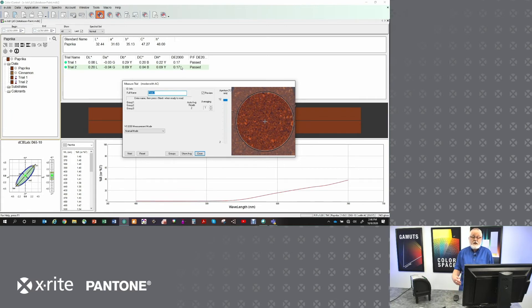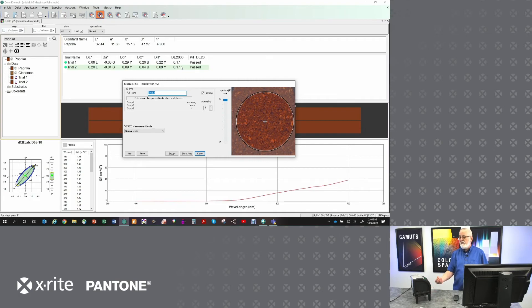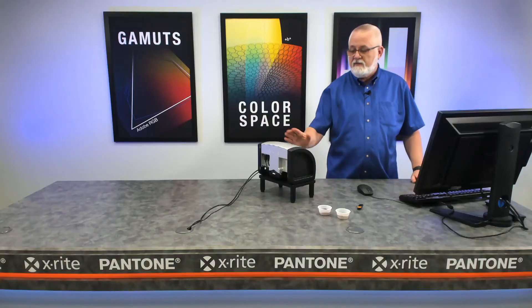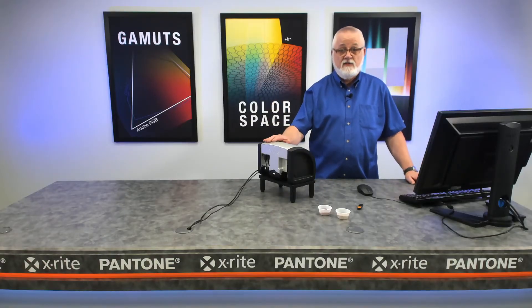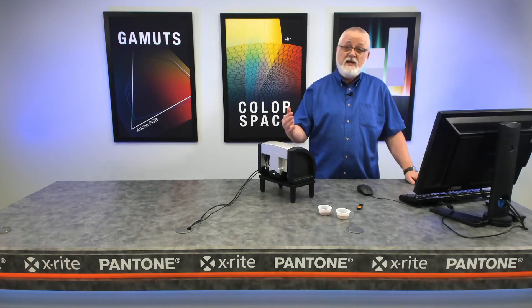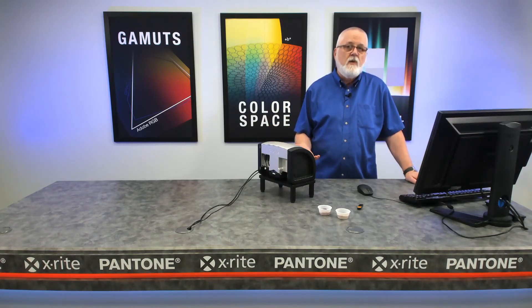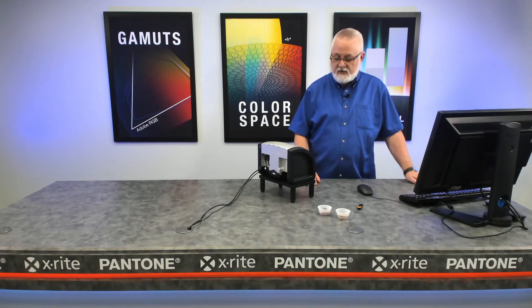Now I can quality control a powder, a liquid could work the same way. We could load it into the spoon the same way and use the fact that this is a non-contact instrument to measure something we can't measure very well in a regular contact kind of instrument.